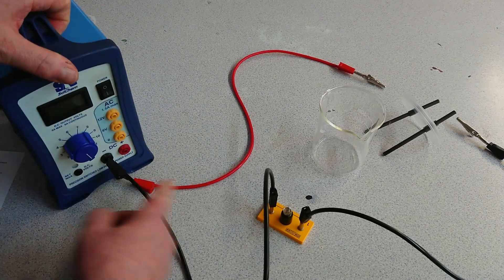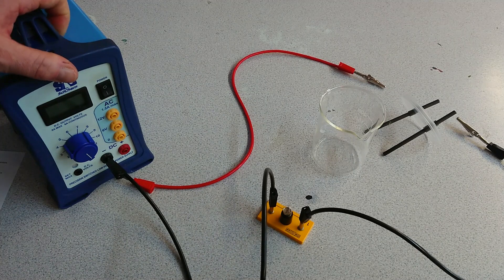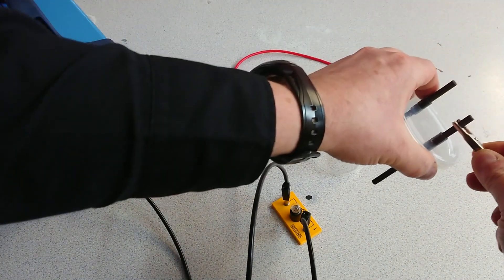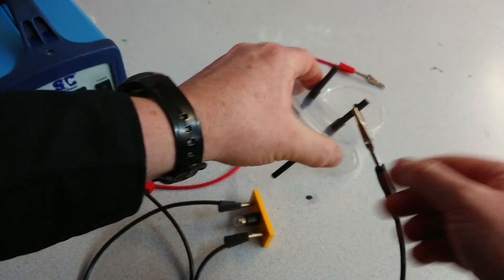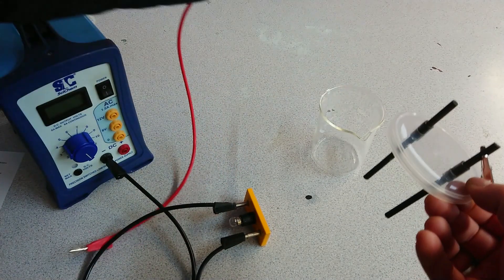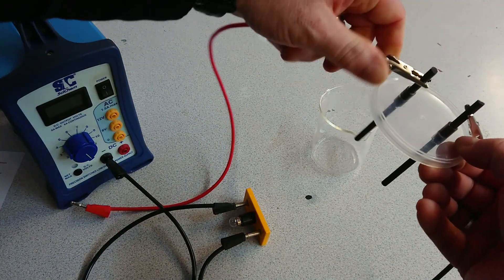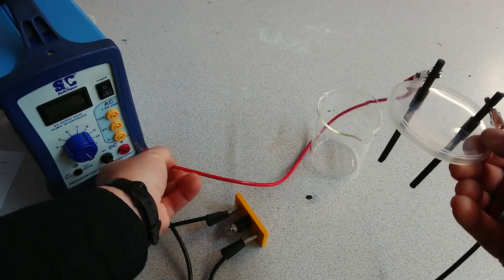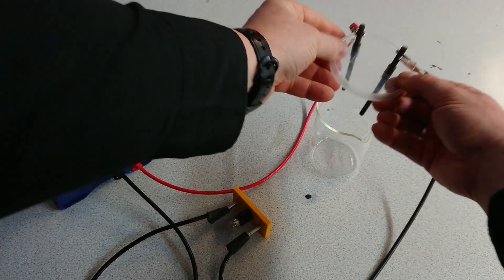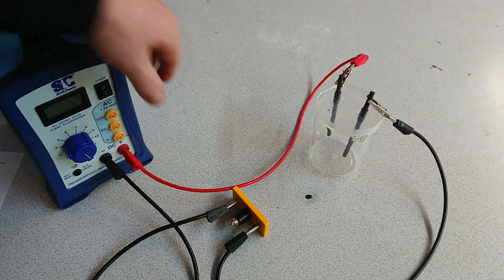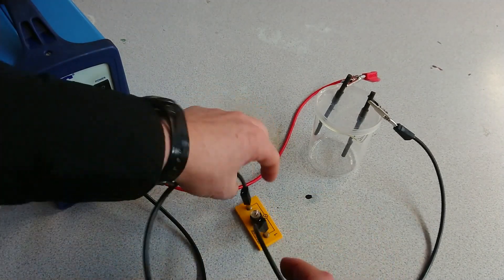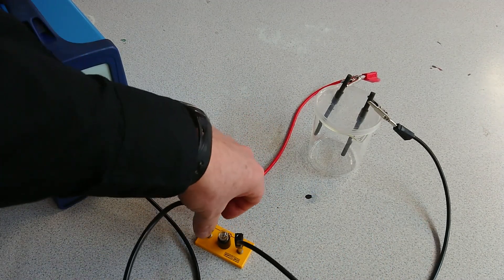And then from the other electrode we return back to the power supply. Now we should see that we have a complete circuit.